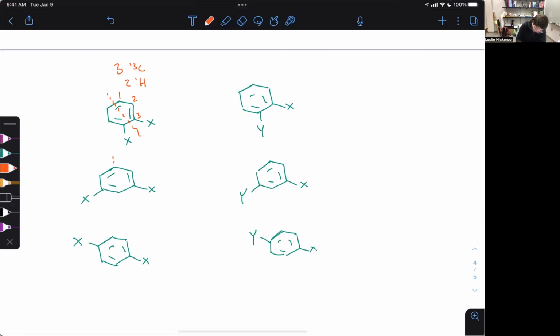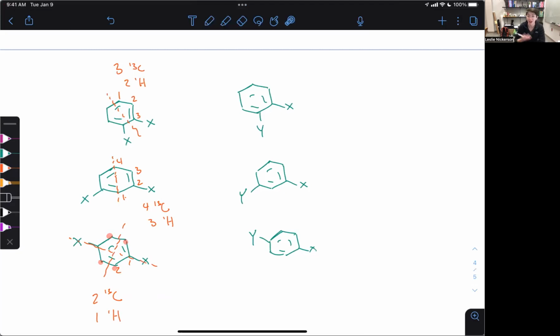So if you're not comfortable with that yet, make sure you review the environments video. So the one where they're 1 away, I've got 1, 2, 3, 4 carbons, and then 3 protons. And then this guy is going to have 2 planes of symmetry. So I'm going to have 2 carbons and then 1 proton. Okay, so all of those proton environments are all identical. So we end up integrating 1 peak to 4.